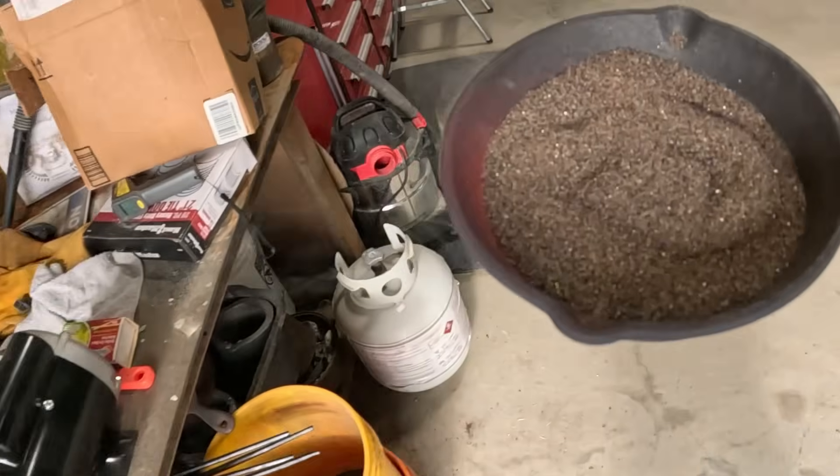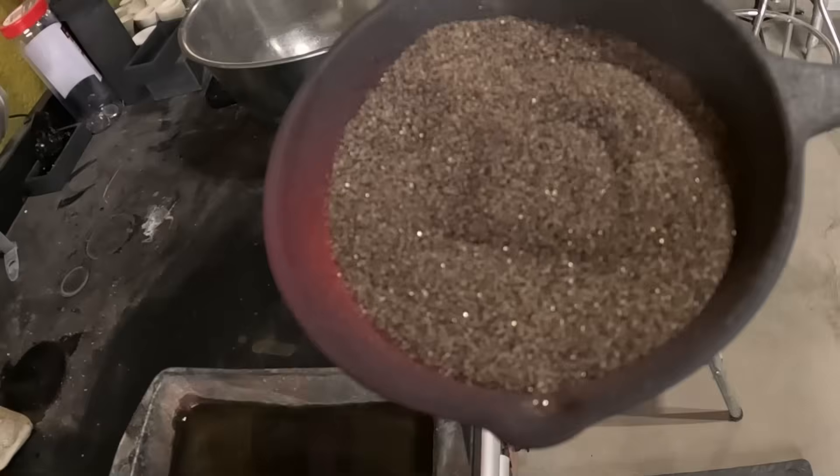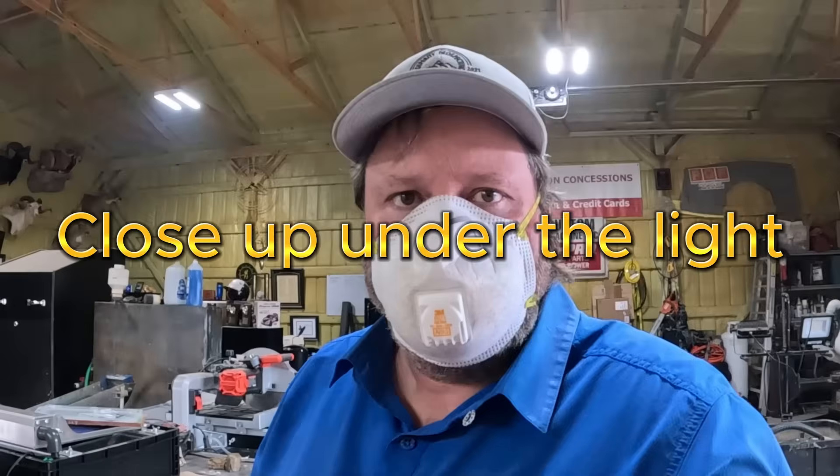Okay, here we go. Cherry red hot. All right, watch this reaction. See all that gold color? Okay, so now I have changed out the water so that we can test my friend's material. I poured all the stuff that the gold extracted from already in here.